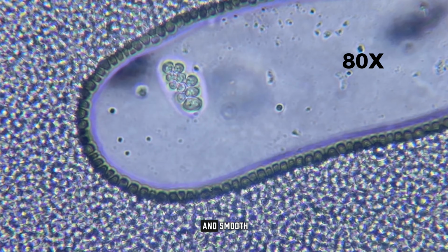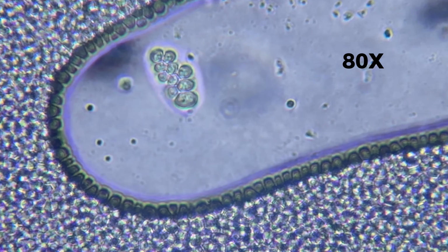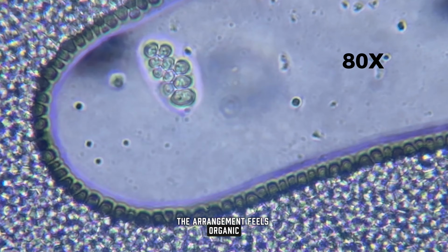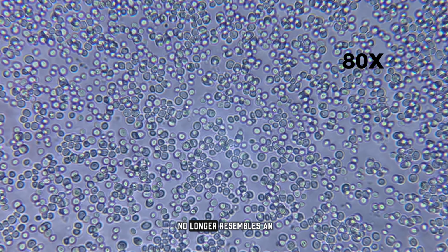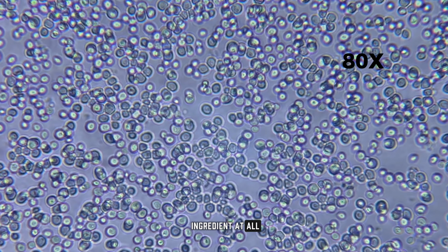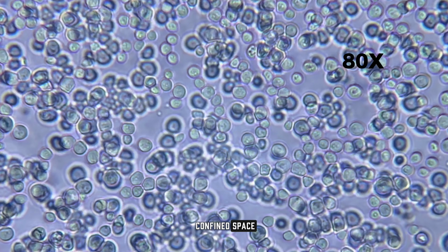Some cells look full and smooth, others show darker centers or uneven interiors. The arrangement feels organic, crowded, and active. At this scale, yeast no longer resembles an ingredient at all. It looks like a living population sharing a confined space.